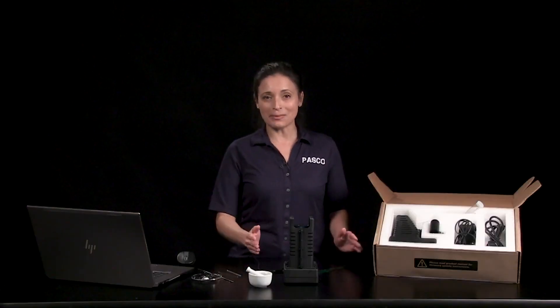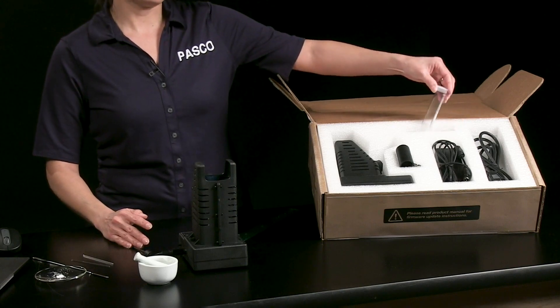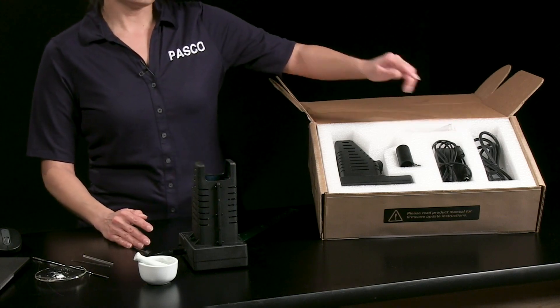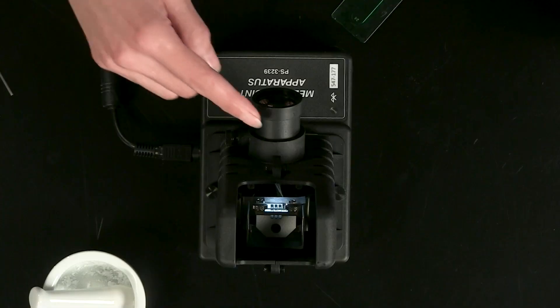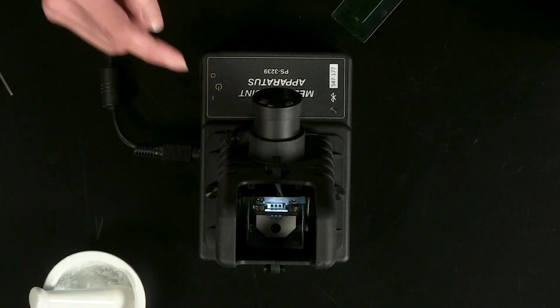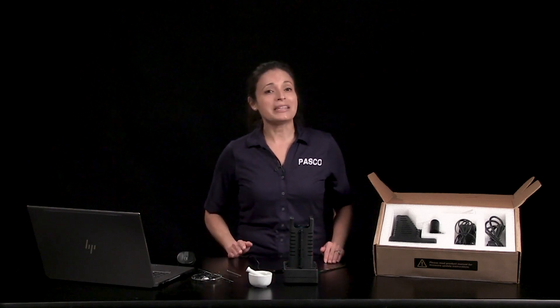The melting point apparatus comes with an AC power supply, a 100-pack of melting point determination tubes, an adapter for an optional eyepiece camera, and a removable eyepiece with three times magnification. I'll be using SparkView in this video, but the apparatus can be used with other PASCO software products.